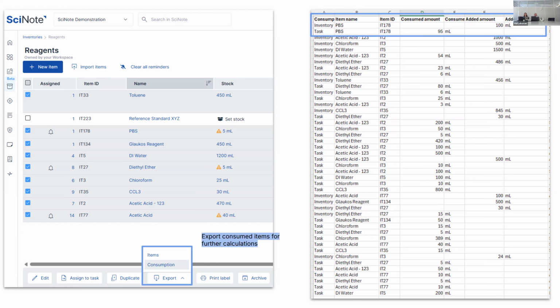What it also allows you to do, again, we go back to time saving. If you want to assign a specific item, you can use a QR code. If you want to find information about the specific item, you can scan the QR code.